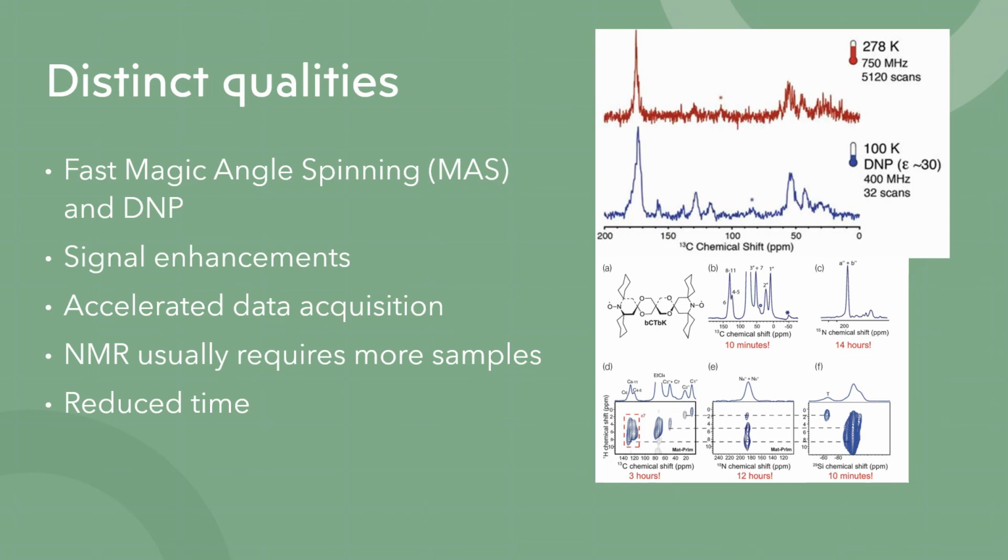And we also see signal enhancement, which is shown on the top right figure right over here. To overcome the sensitivity restrictions posed by standard NMR, DNP NMR has become much more popular for solid state. Signal enhancements range from a factor of 20 to 400, which is insane.